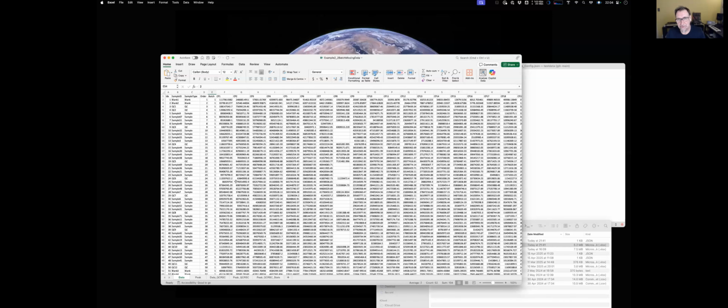Other people have suggested that you should have a pooled QC for the controls and a pooled QC for the cases. Very dangerous, because you're biasing your correction. Say you have correction in your diseases and no correction in your controls, then you're actually correcting out something biological. So you don't want to be doing that, even though it's related to the injection order. There might be something there that you're messing with.